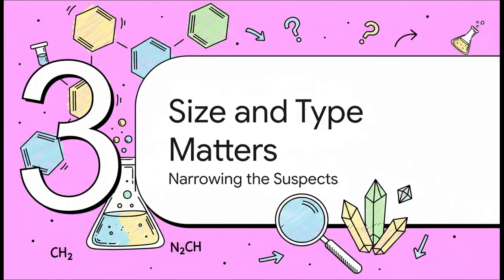All right, quick recap. We know it's a carb, we have an idea if it's a reducing sugar, and we've checked if it's a big polysaccharide. Now let's get even more granular. We need to figure out its size. Is it a single sugar unit, a monosaccharide, or is it 2 units stuck together, a disaccharide? And what about its basic structure?